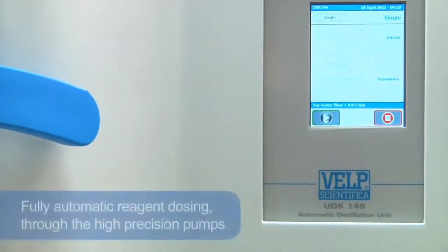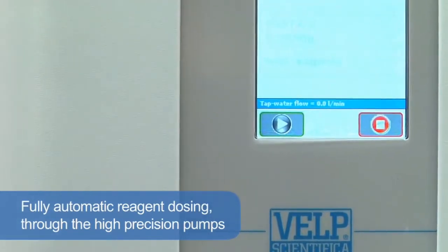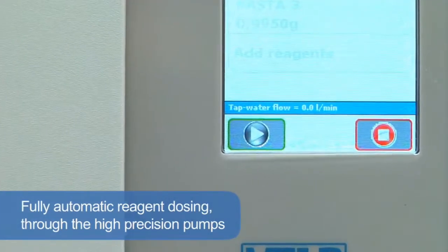The unit ensures simple and safe operation with reliable analytical results thanks to the fully automatic reagent dosing through the high-precision pumps.